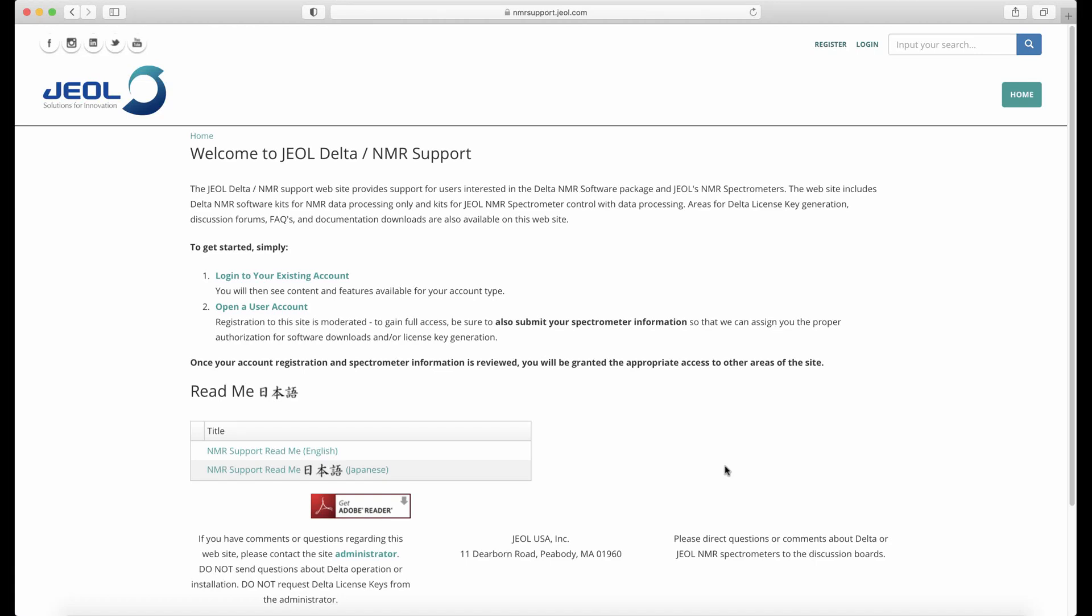In order to download a copy of Delta or generate a permanent license key, you need to register on our website, nmrsupport.jeol.com.